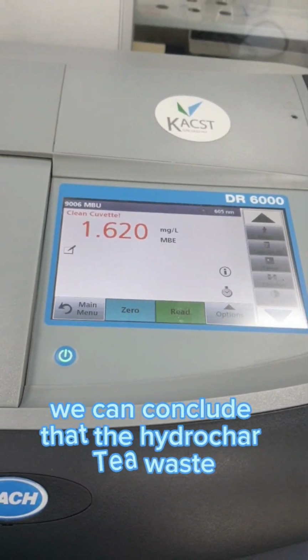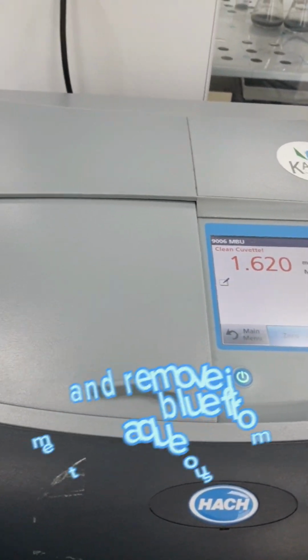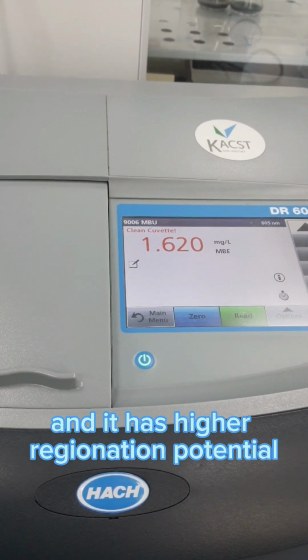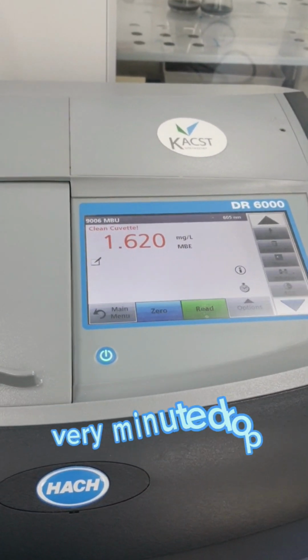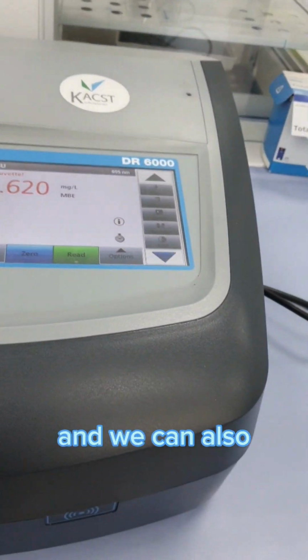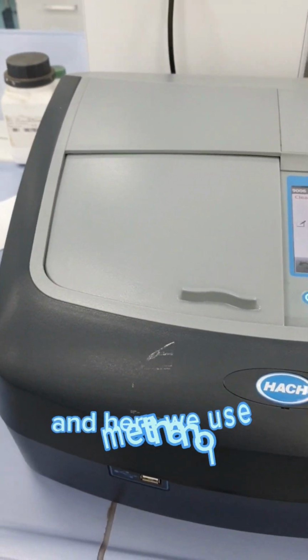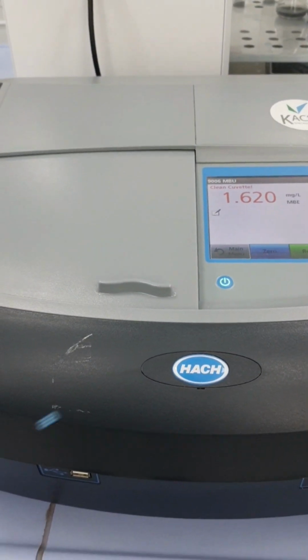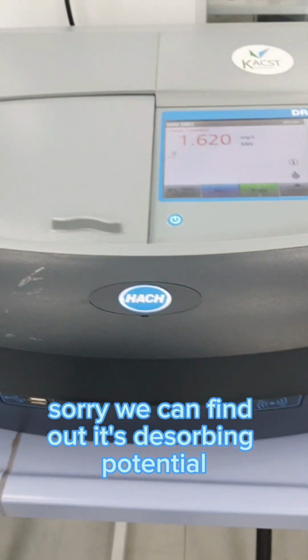We can conclude that the tea waste hydrochar has a greater potential in removing methylene blue from the aqueous medium, and it has higher regeneration potential as compared to the raw pozzolana, because there is a very minute drop from the first cycle. So we will stop here, and we can also go to as many as 5-6 cycles, and here we used methanol. We can also use other desorbing agents, and then we can find out their desorbing potential.